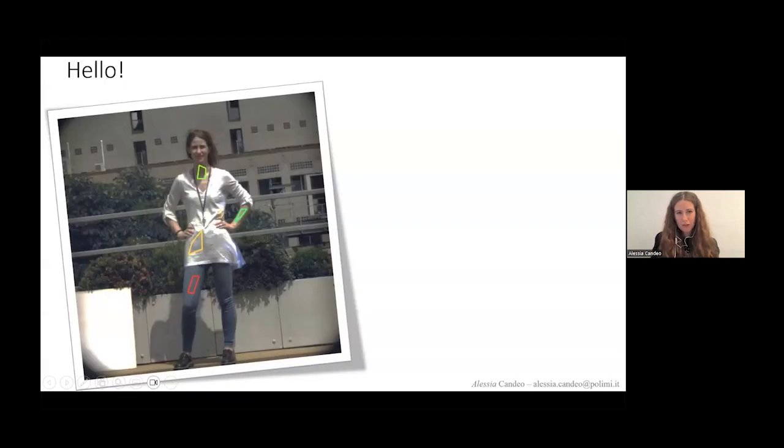I will first of all start with introducing myself another time with a picture of myself. That's me. I'm on the rooftop of our physics department. That's not actually just a picture of me, but it's a hyperspectral image. So it's an image where we have for each pixel not only spatial information, but also spectral information.